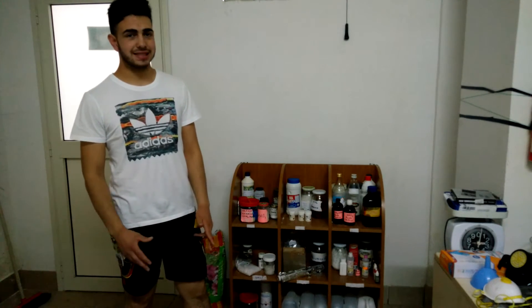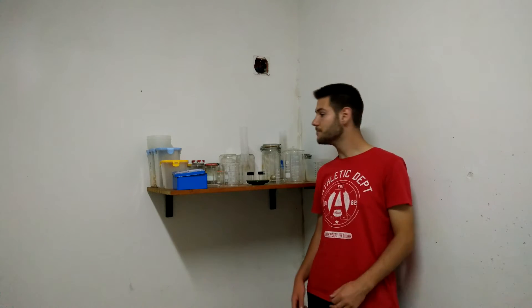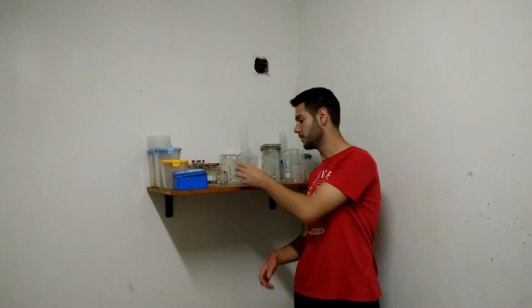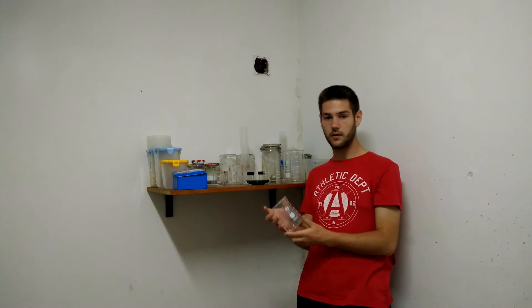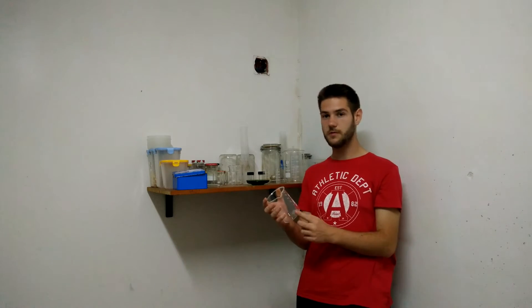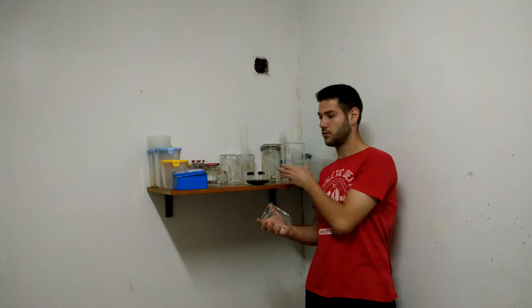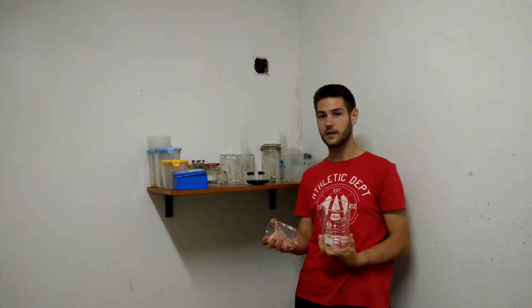It must be distilled water, and finally sugar. Another important part of our laboratory is the glassware. The most important thing that you must have in your laboratory are the beakers, because only with beakers you are able to make solutions in a clean environment. Beakers, as you may also know, are made of a special kind of glass, called Pyrex or borosilicate.